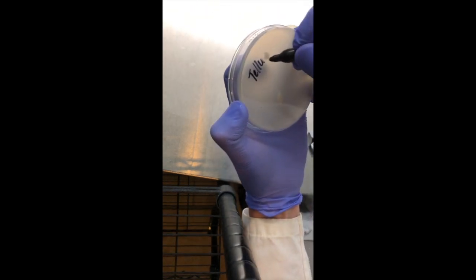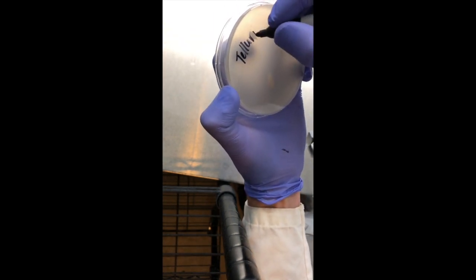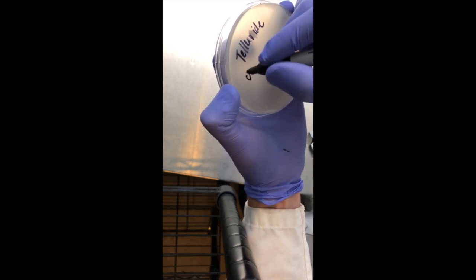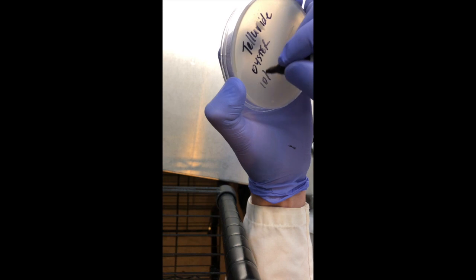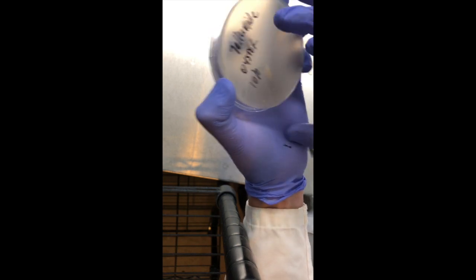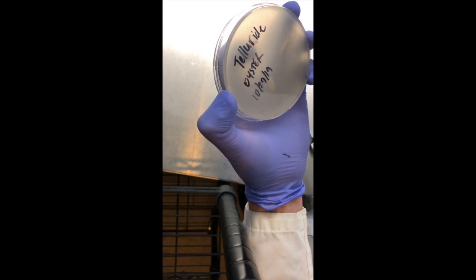After you have your cuts, it's important to label. I always label on the bottom of the petri dish — that way if the plates fall over or a stacker falls and the tops get mixed up, you'll still know the culture. It's also easier to observe contamination when there's no writing on the top.